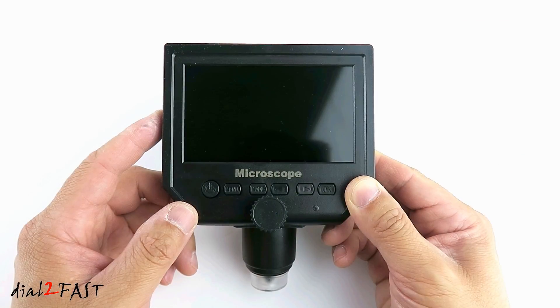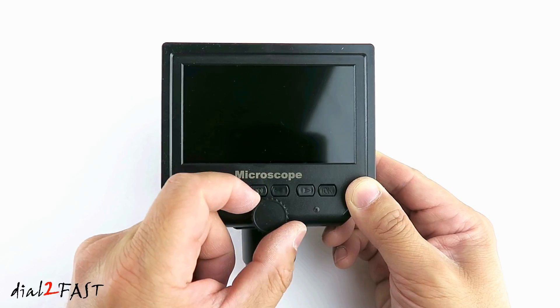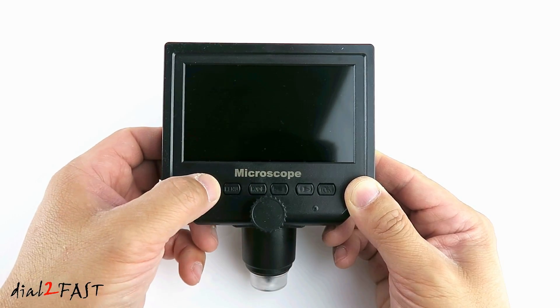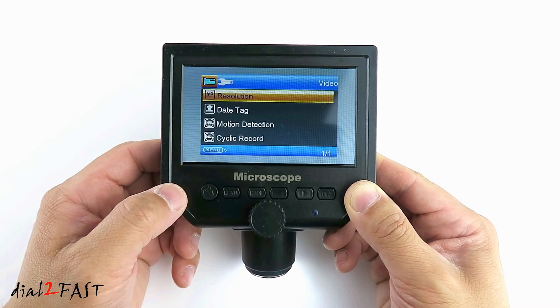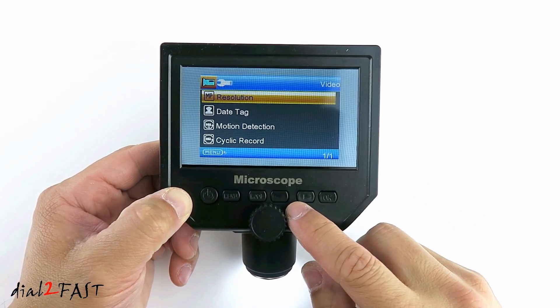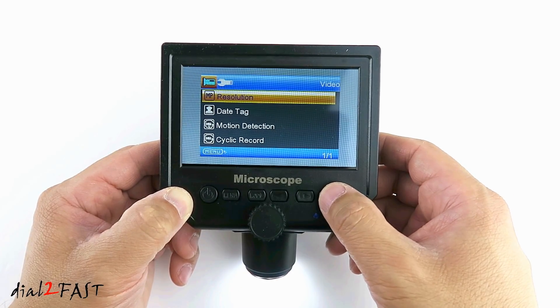Let's have a look at this microscope. On the front we have this focus dial — use this to adjust the focus. Next to it is the LED status. Over here is the power button. If you press this once, the unit will turn on. Here's the menu button — press this once and now we're in the camera setup menu. You can use the right and left arrow keys to scroll up and down, and press the OK button to select.